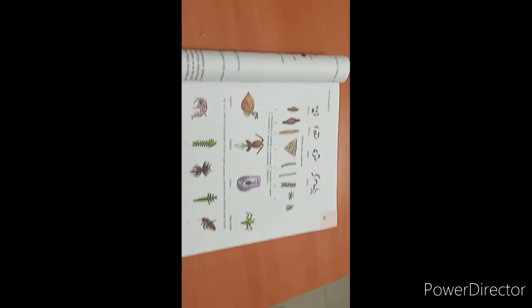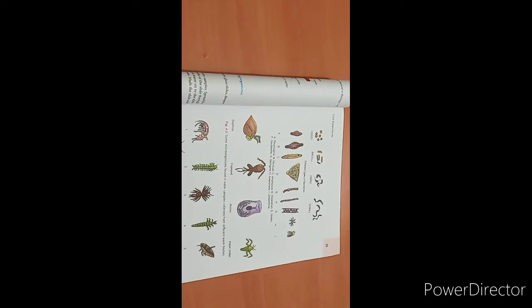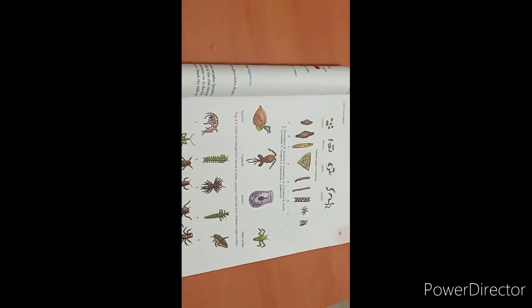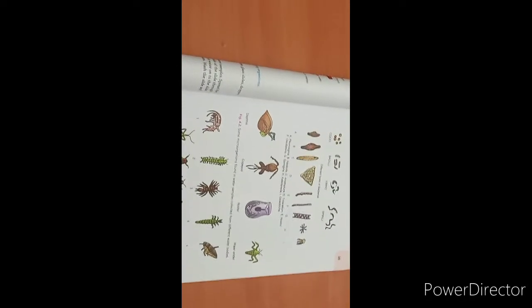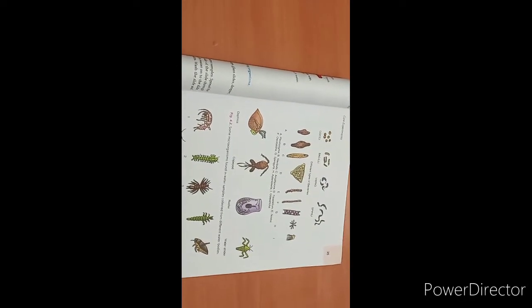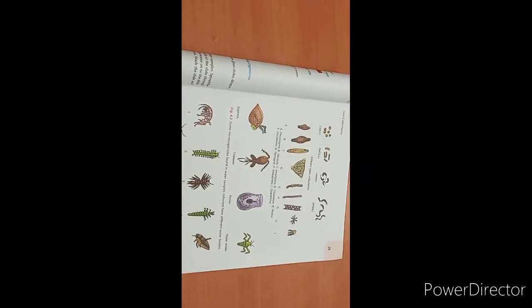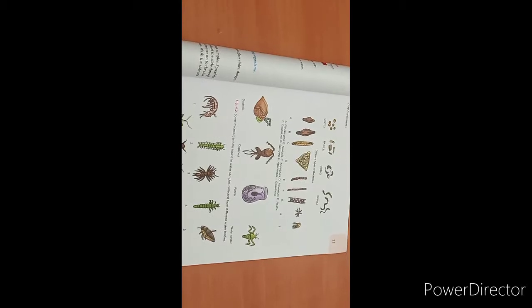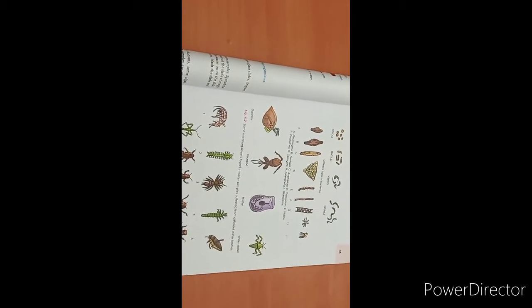Now the precautions for this experiment are, children, first of all, you have to be very careful regarding the droppers that you are going to use. Different droppers should be used for different water samples. The mixing should not be done. Otherwise, if some microorganisms are present in pond water, they will get mixed up with the tap water or any other water sample that you have taken.